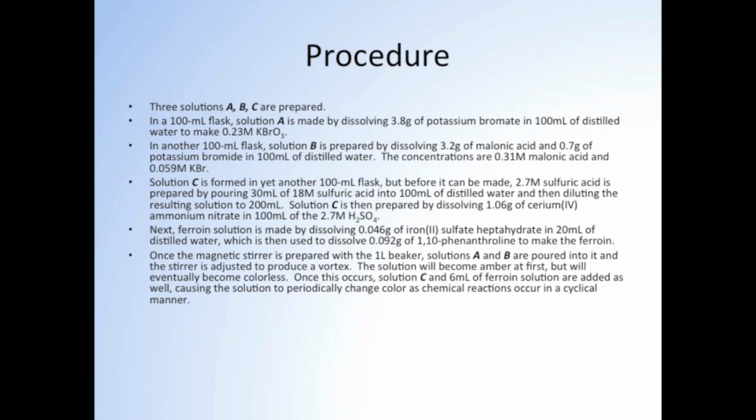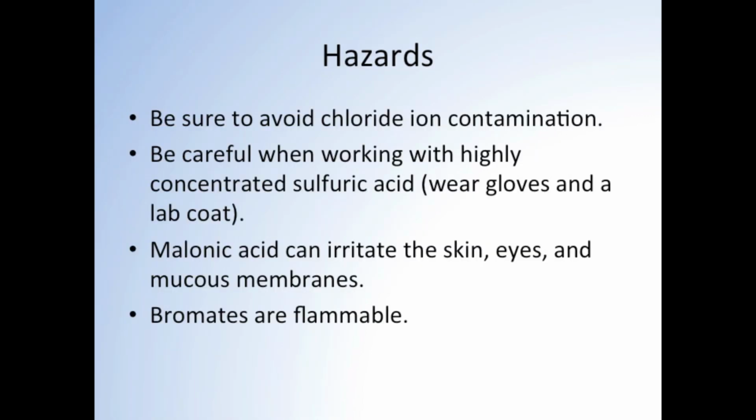This slide presents the procedure in more detail for those who wish to recreate the experiment. When attempting this demonstration, avoid chloride ion contamination, as even a small amount can interfere with the reaction mechanism. Sulfuric acid is a strong acid and a dehydrating agent, so it can cause burns. Wear gloves and a lab coat for safety and make sure spills are cleaned up with an appropriate chemical, such as sodium bicarbonate. Additionally, malonic acid is a strong irritant and bromates are flammable.